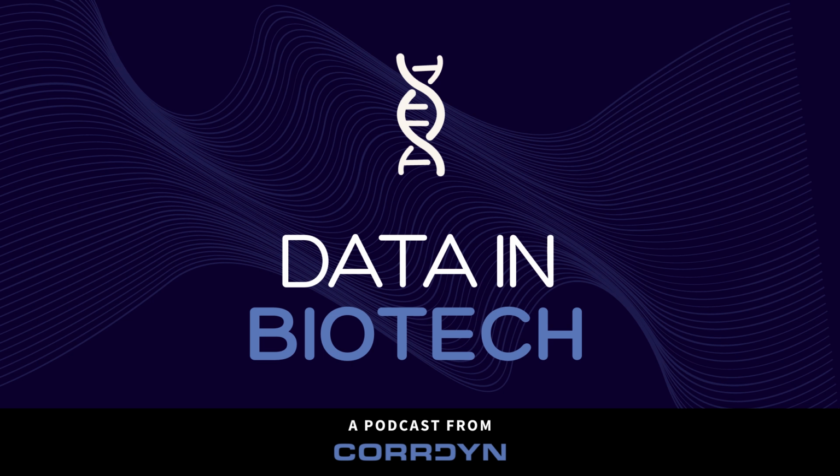In this episode, we speak with Yaron David, CTO and co-founder of BioRaptor, to explore how biotech companies can gain a holistic view of bioprocessing through real-time data integration, visualization, and modeling. You can expect to learn why Excel is holding back innovation in bioprocessing labs, how BioRaptor enables holistic bioprocess understanding across experiments, the role of virtual sensors in enhancing real-time data visibility, and the difference between operational and optimization AI in biotech.